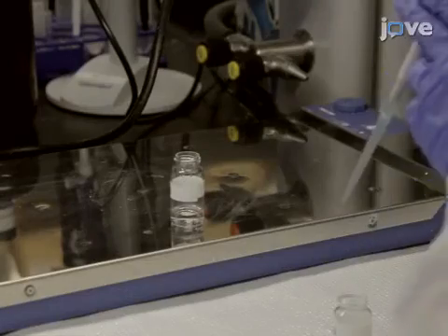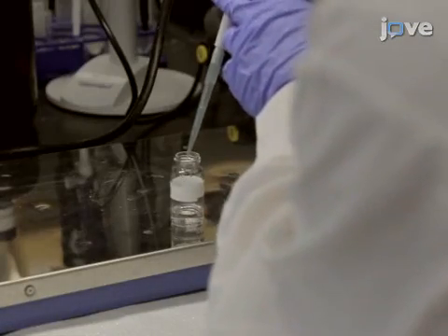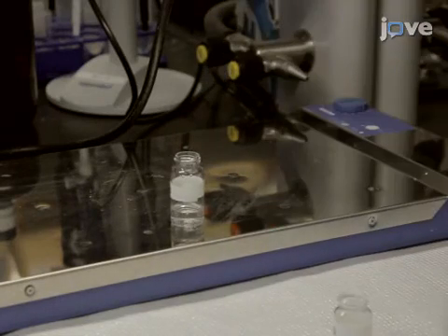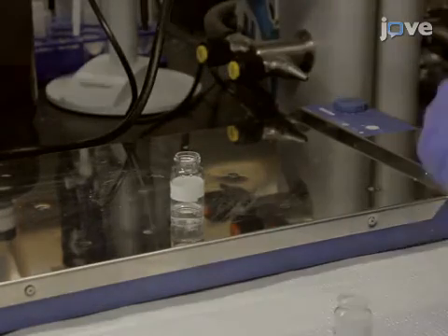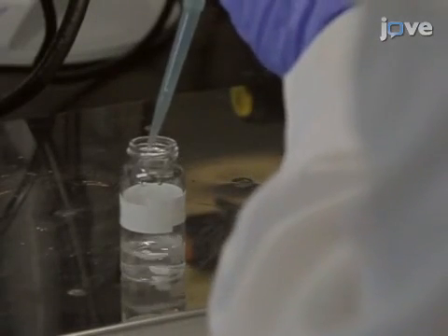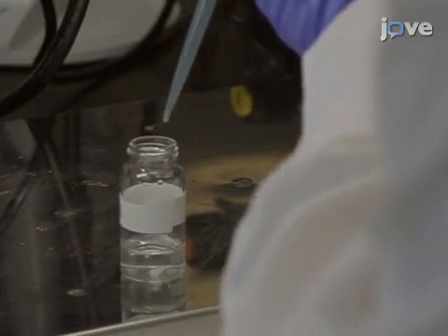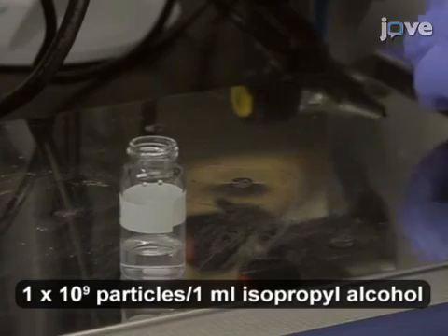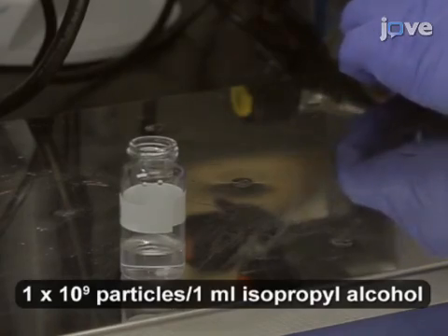First, oxidize non-functionalized porous silicon particles in a 30% solution of hydrogen peroxide at 95 degrees Celsius for 2 hours. When finished, aminate the oxidized particles in a 2% 3-aminopropyl triethoxysilane solution in isopropyl alcohol for 2 days at 65 degrees Celsius with gentle stirring.